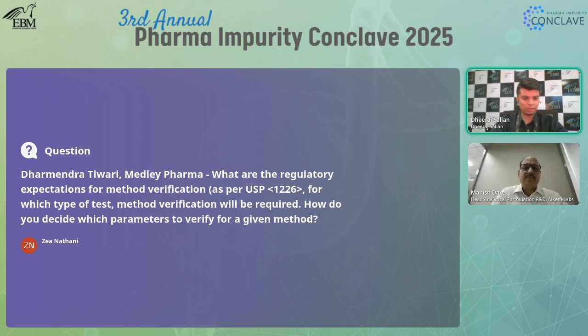So the first question we have is from Dharmendra Tiwari, Medley Pharma. He asks, what are the regulatory expectations for method verification as per USP 1226? For which type of test method verification will be required? That's number one. Then we have another question in part.